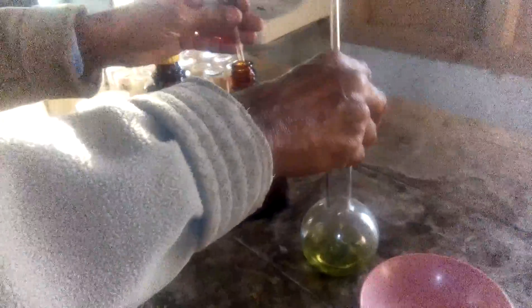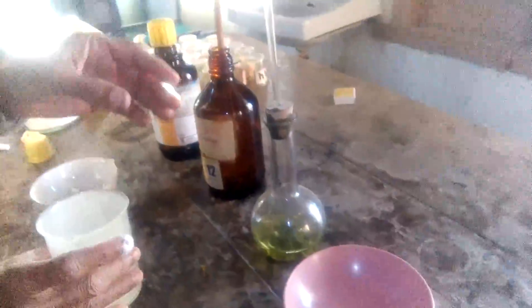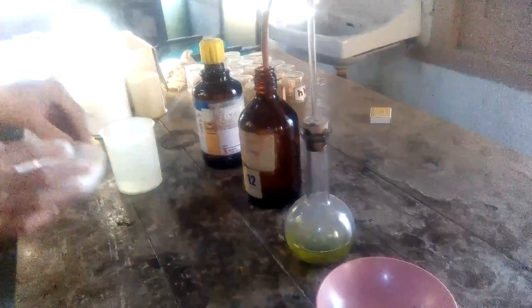Now this gas is evolved vigorously. This gas is transferred from the round bottom flask through a converter into the distilled water. After some time, evolution of this gas starts. We pack this — add some water — and pack this cork with plaster of Paris.